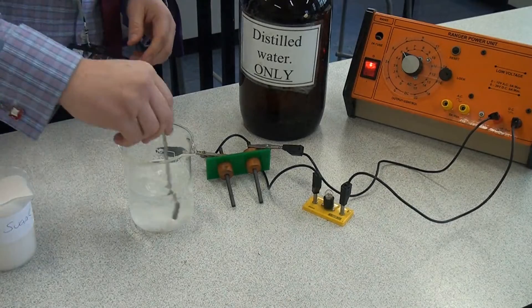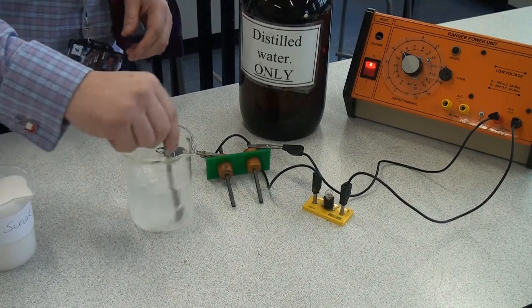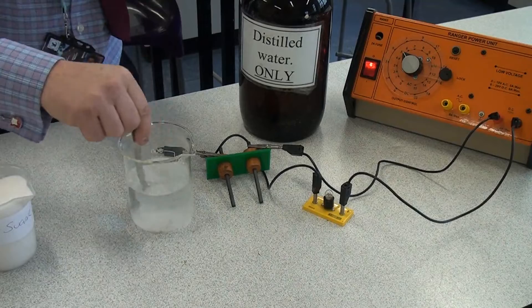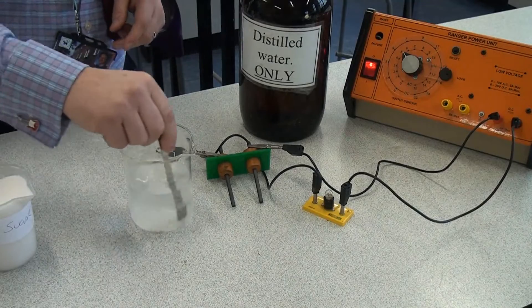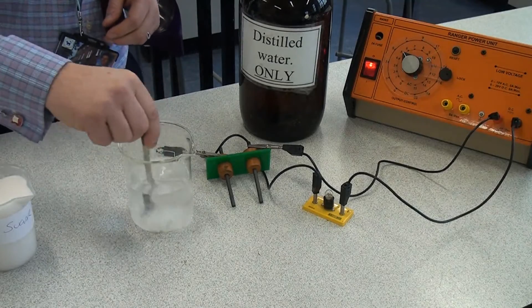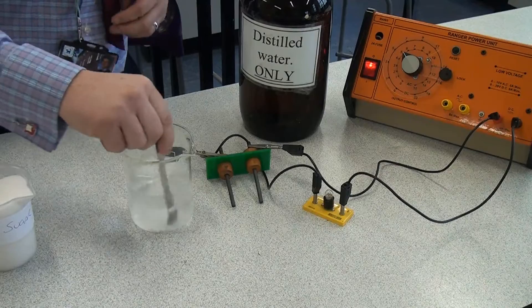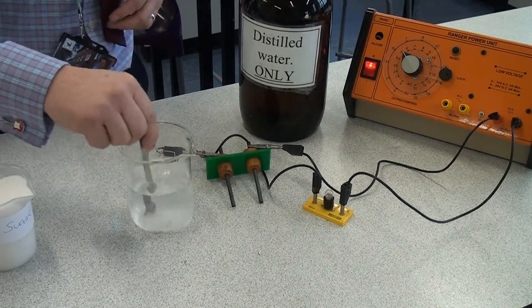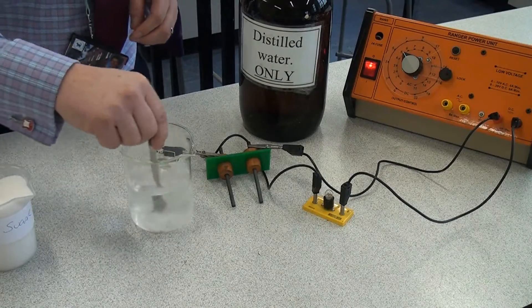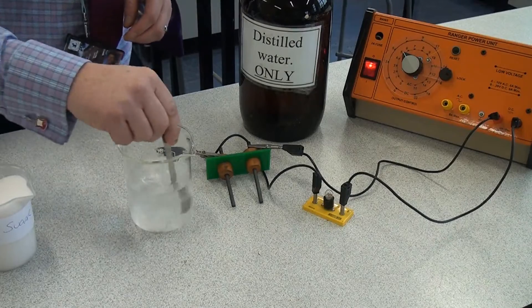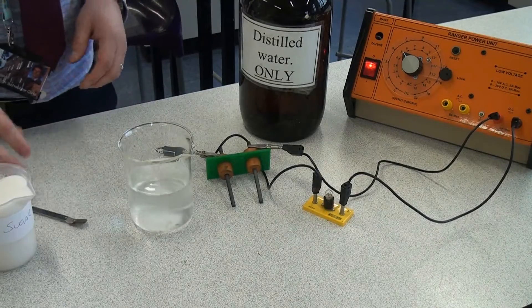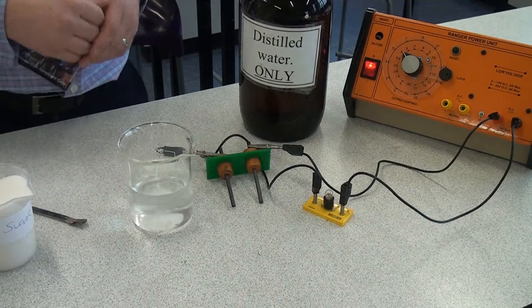So although it might be a saturated solution now some of that sugar will have dissolved. You'll notice I'm using distilled water because that means it won't have any other ions in there. It will just have the sugar. So the distilled water itself is a pure substance. It's only got the compound water and nothing else in there. So a lot of that sugar will now be dissolved in the water.